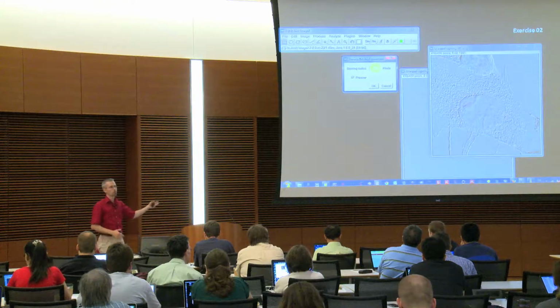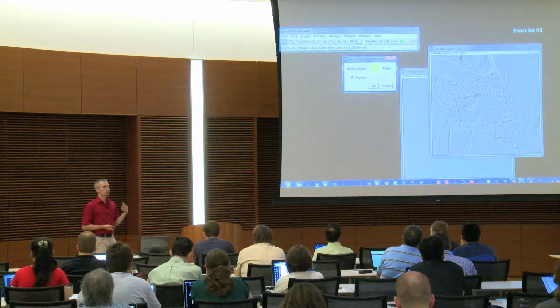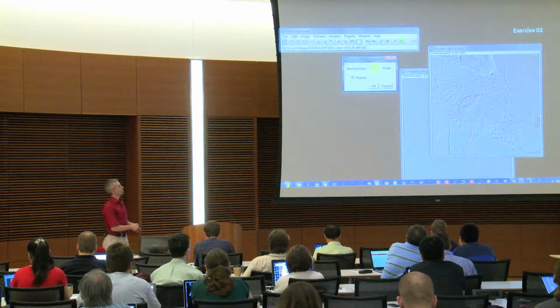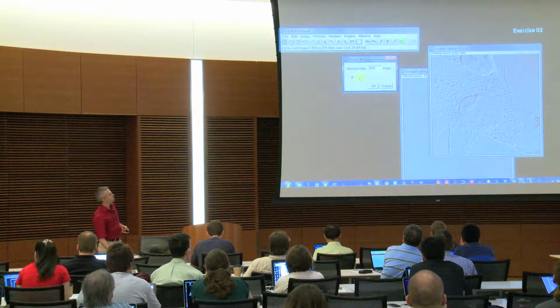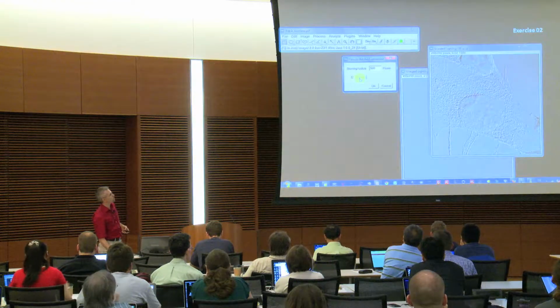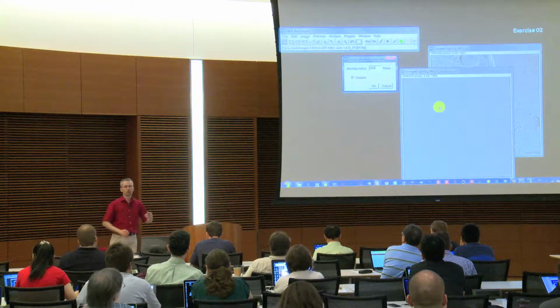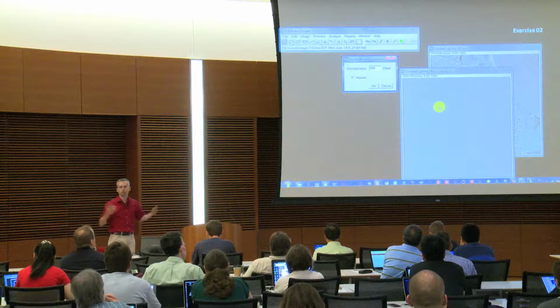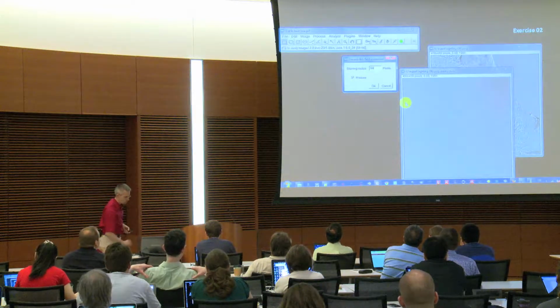Something between 40 and 60 is fairly well suitable, but bigger is not better, because if I now go, for example, to 500, then you see that actually now I have again my different lighting. It's just slightly corrected. The reason for that is that if I blur my background that strongly, then I also completely eliminate the shading differences in my background. So obviously I have nothing to correct by. That's why this is not really helpful.